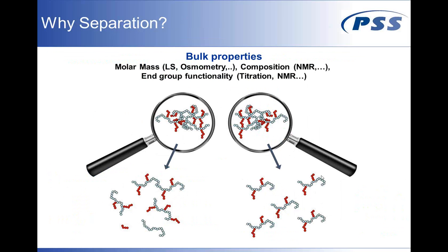This here contains only this very nice grafted product. It's a completely homogeneous polymer, which you will never find in reality. And here you have blue chains, completely blue chains, you have red chains, and you have different graft products.